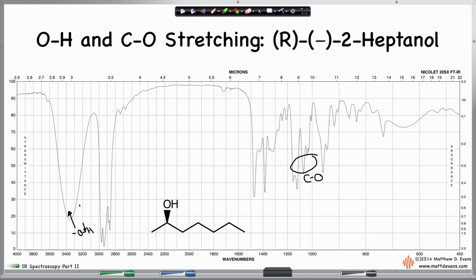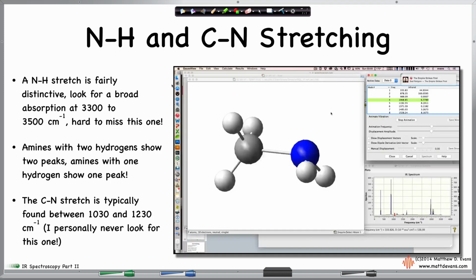This one is the obvious one. This is the one that tells us right away that this molecule, if it's truly an unknown molecule, is an alcohol, and you've got that much in your molecule. I'm not sure if I have another example of this. I didn't have another example, but that's fine because OH is so easy to spot.